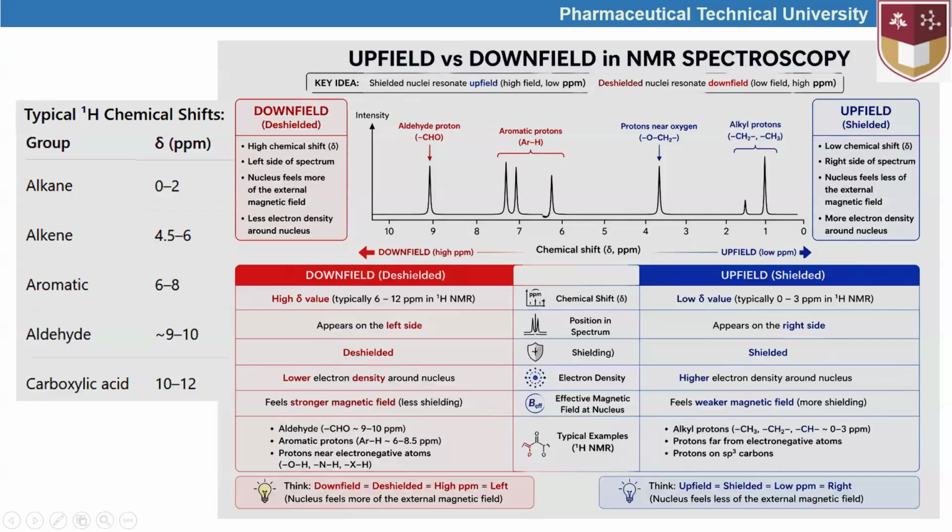Okay, again, let me remind you of the difference between the radio waves at 0 ppm and 7 ppm. At 0 ppm we can use, for example, 750 million hertz, or in parts per million we use, let's say, 0 hertz.